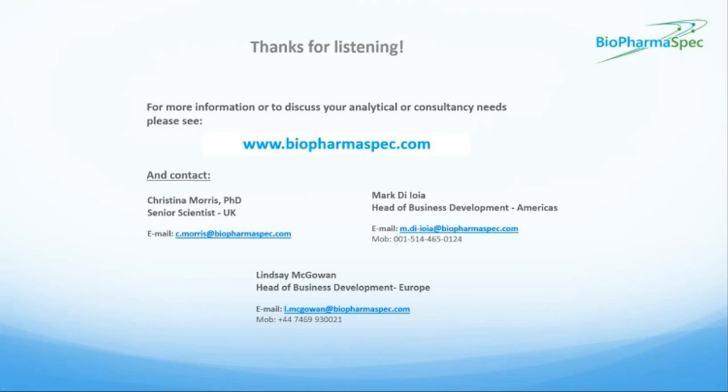Thank you. It looks like we have time for one more question. You showed a graph for the amount in parts per million, ng, mg, of HCP in different steps of purification. Can you share how the absolute quantification was done? Thank you. Okay, I'd probably need to see which graph we were talking about there. Do we have a slide number? I don't, and I'm not sure that we're able to. Are we talking about the full assessment when we were showing clearance?